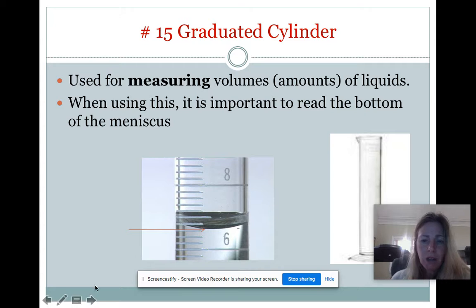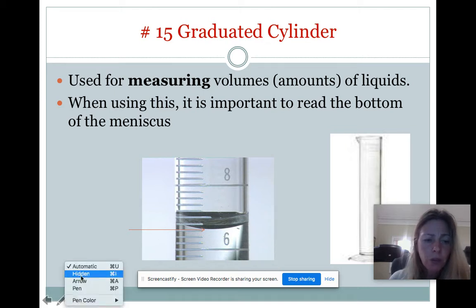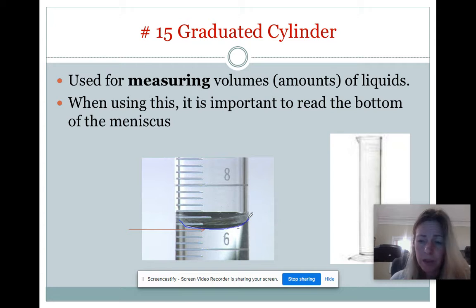All right, measuring with graduated cylinders. So this is really important. This might be review for you. We'll probably have a worksheet or virtually you might have a worksheet for this. Depends on how class time runs. When you're looking at liquids, now a lot of people think this is always the case. But it depends on the liquid that you're using. So in biology, we usually use water.